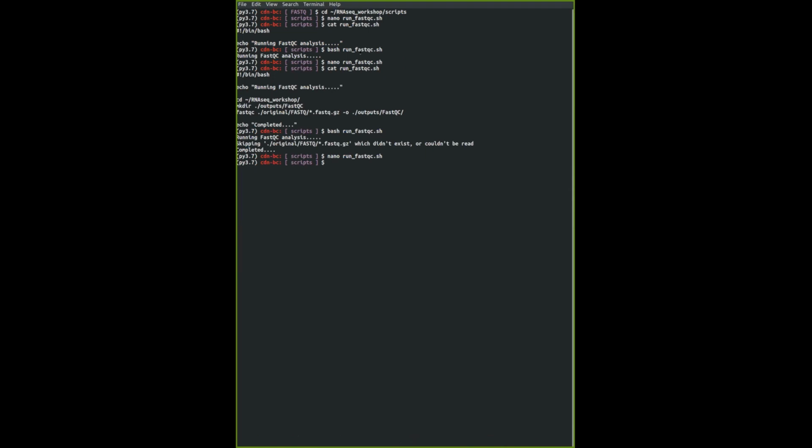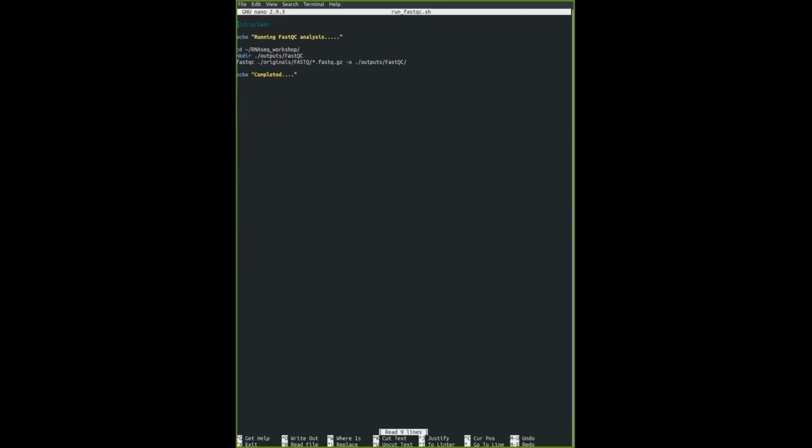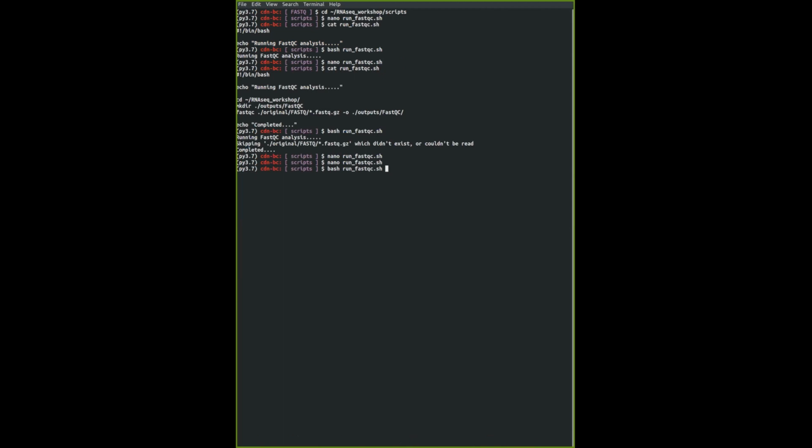Happens. I'm not perfect. Oh, sorry, not this, it should be bash. I make this mistake over and over again whenever you start to type in scripts.